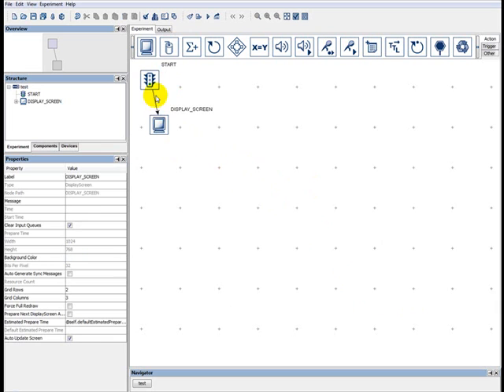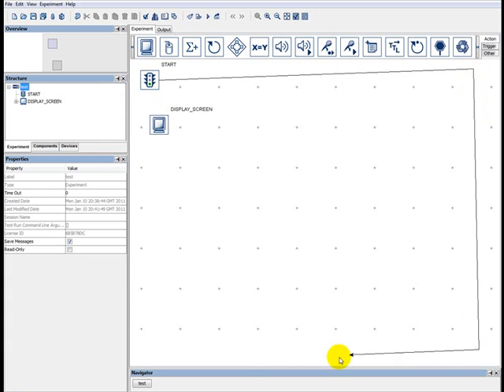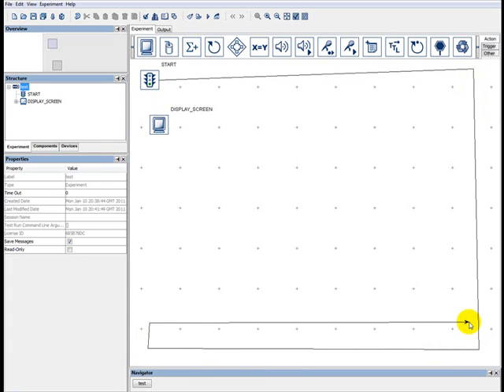It's quite fun. If you want to disconnect two elements, you can click on the little arrow between the two things like this. It'll be highlighted with a yellow area here, and then you press delete. Okay, then of course you can do really daft things like drawing an arrow. So if you drag it out to here, say, from the start thing, and then let go of the mouse, it continues to follow your mouse around, so you can have some fun with it like this if you really want to.